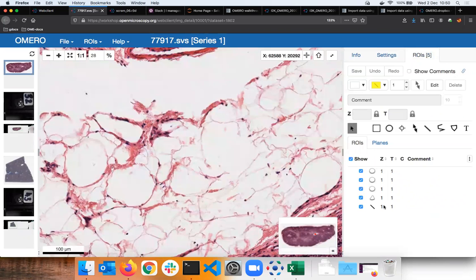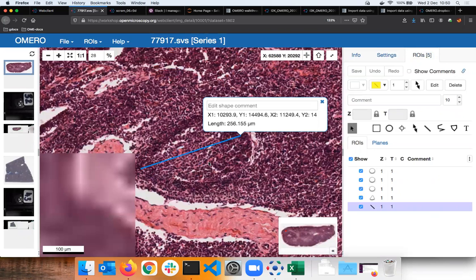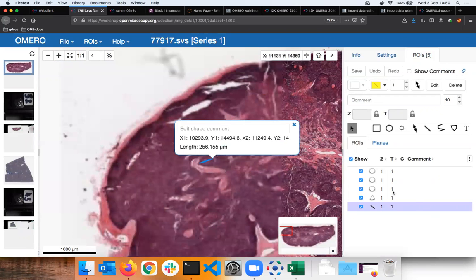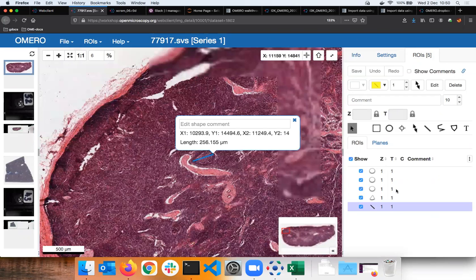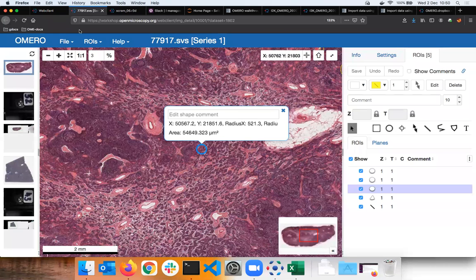And if I click on the line, you can see that the viewer jumped like miles away from where I was to navigate to that ROI, which would be very difficult otherwise to achieve, because I would have to zoom out and lose my bearing and not see the ROIs in this big zoom. So this is a circle in the middle. Very good. So much for the OMERO iViewer.